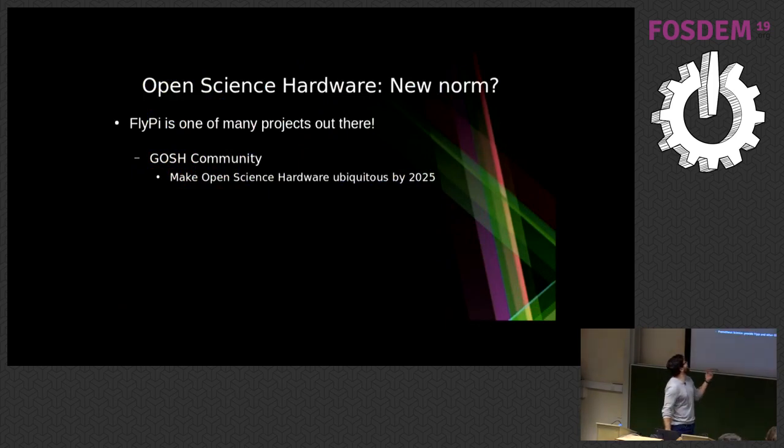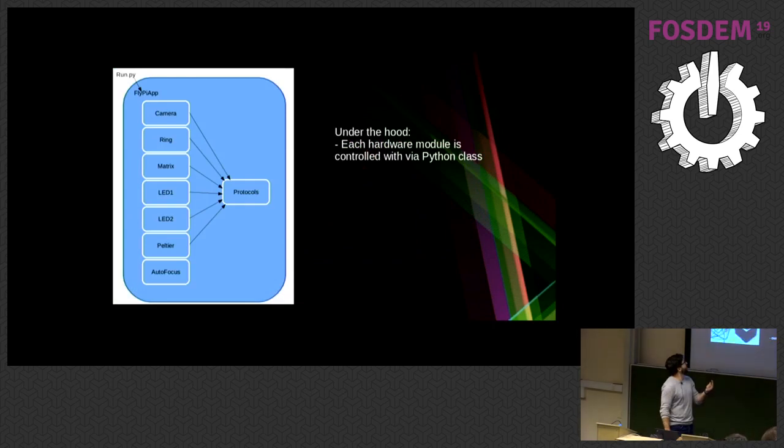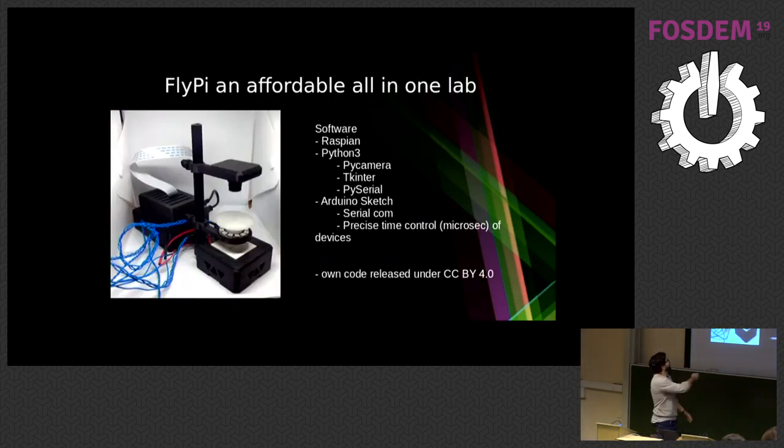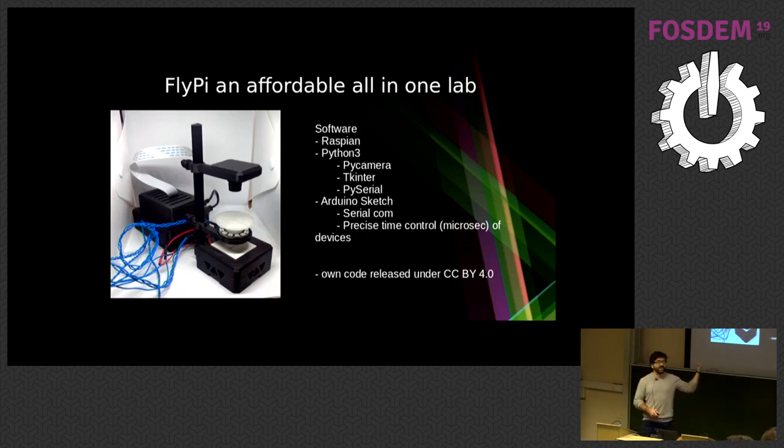Sorry, yeah, of course. So this is the Pi camera, really the first version. And the only difference, how could I forget that? That's absurd. So you can see it here, right? And this has a little lens that comes from surveillance cameras. So it's an M12 thread that you can get anywhere, and we just adapt this in front of the Pi camera. And then by changing how far this lens is from the sensor of the camera, you can get a higher or smaller magnification. Right, so you can find the version of the camera on KitSpace.